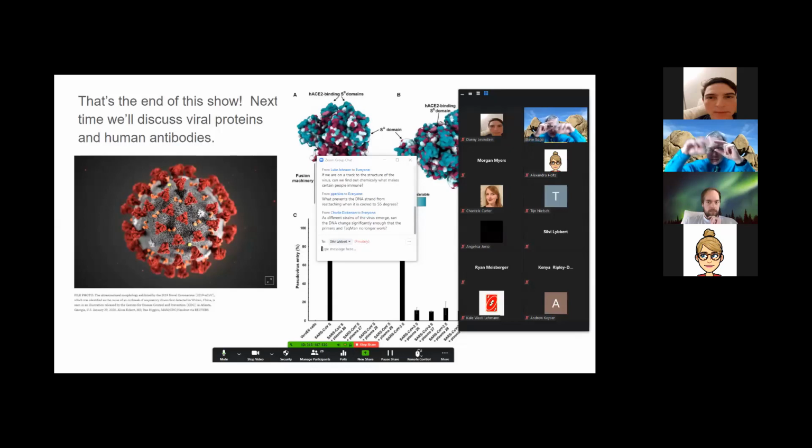A lot of virus samples have been sequenced, and they do have modifications and mutations, so they're not all the same, but the regions of high variability are the ones that you avoid when you design your primers. Usually there are certain portions of the viral genome that cannot be changed. If you change it, it doesn't work anymore. So those are called conserved regions.